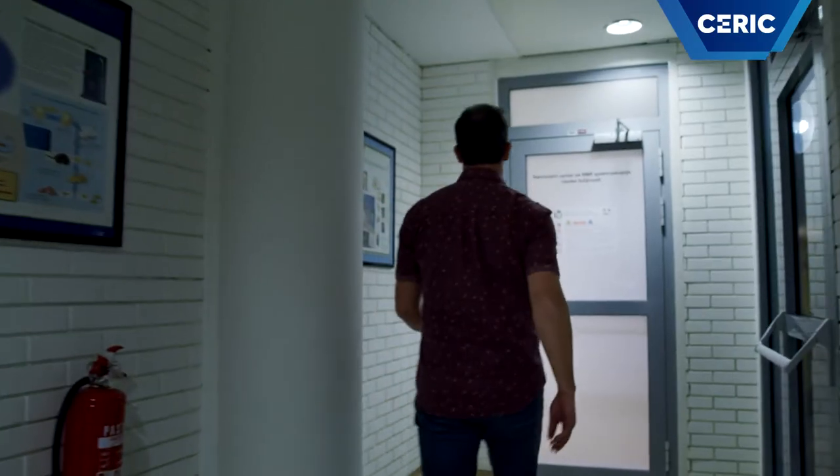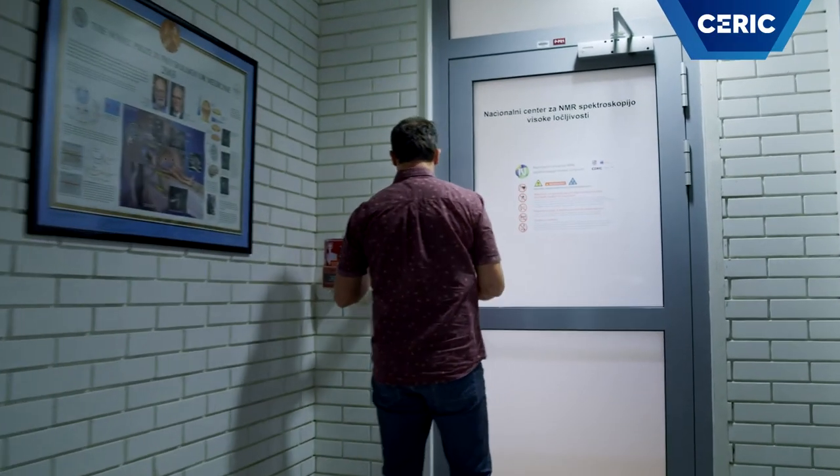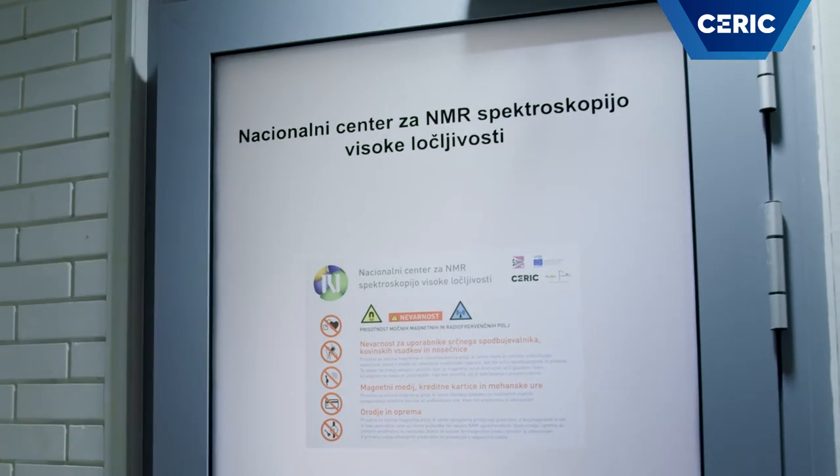My name is Gregor Mali. I'm a research professor at the Department of Inorganic Chemistry and Technology at this institute. I use solid-state NMR spectroscopy for studying various materials, and I've been doing this for more than two decades already. So let's visit our lab.